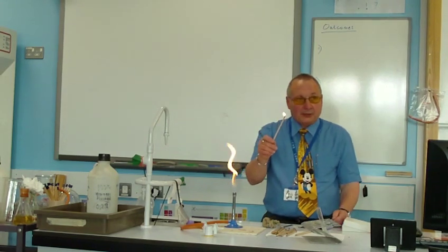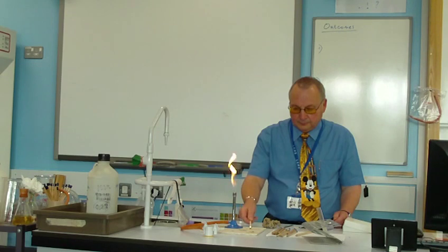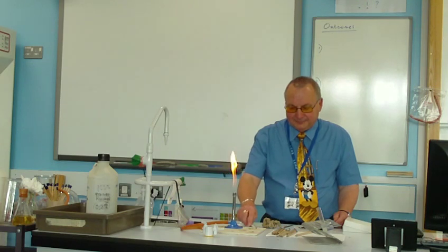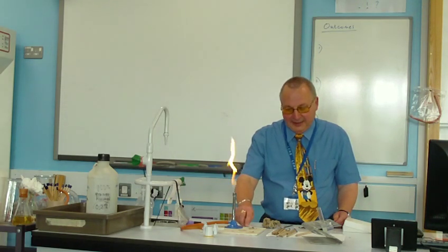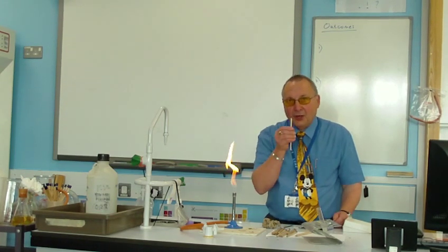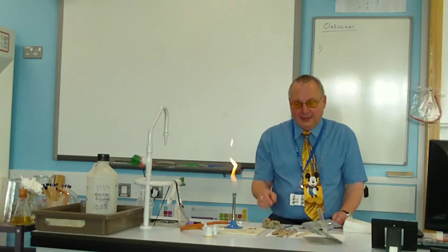When you've done your pop test and you've finished with it for the time being, just move it round and in time it will go out. Don't be tempted to pick it up. You can just leave it there. But again, don't pick it up at that end straight away.